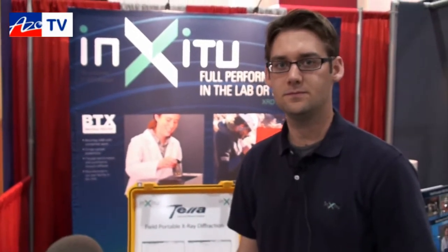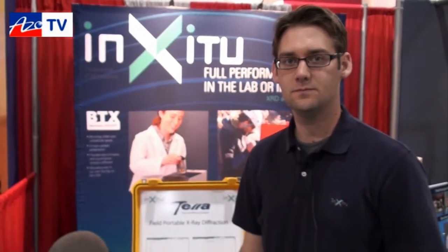This is Cameron Chide bringing you another episode of AzoTV, and today I'm speaking to Tyler Jennison from InSitu. He's going to show us their Terra portable x-ray diffraction system.